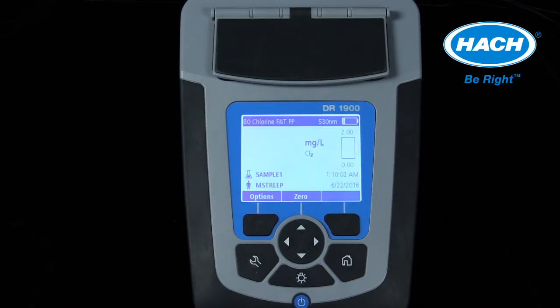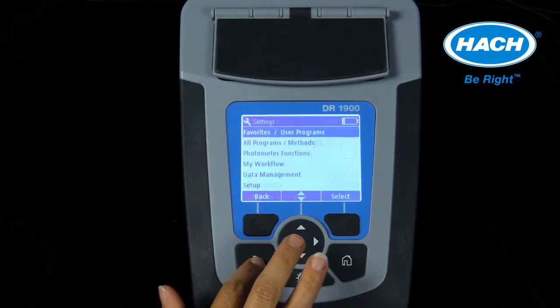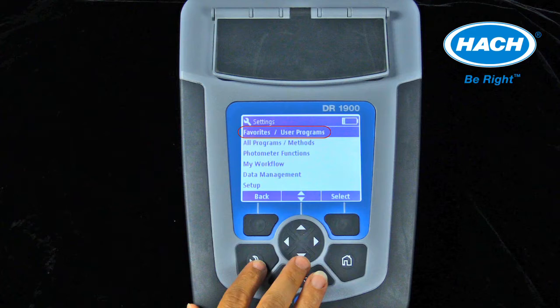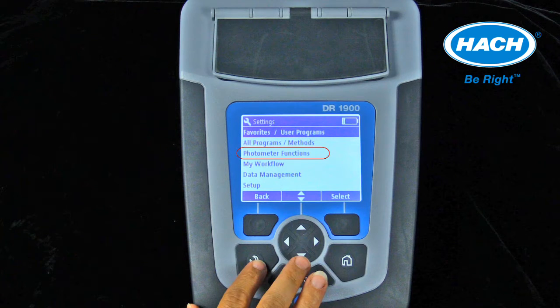The wrench key enters the settings menu. The software settings menu allows for the following instrument controls, such as selecting favorite programs, user programs, or Hawk stored programs, and photometer functions that allow the spectrophotometer to measure in single, multi-wavelength, or in time course mode.